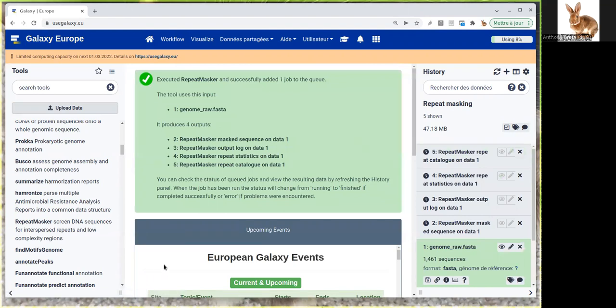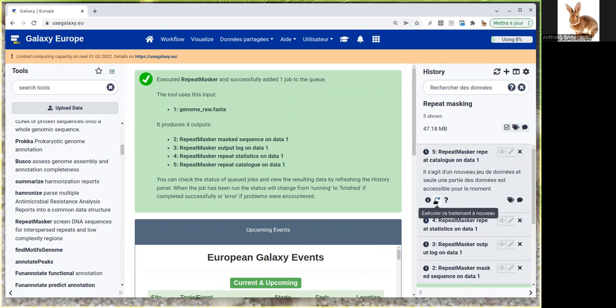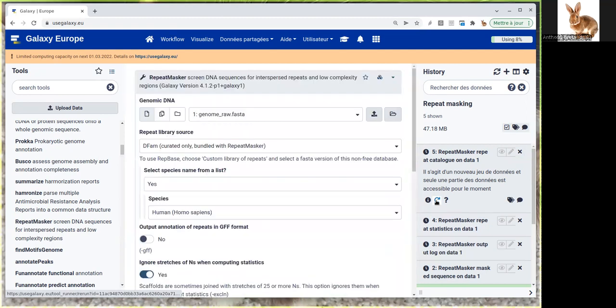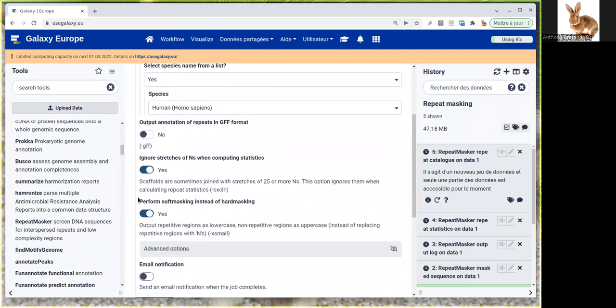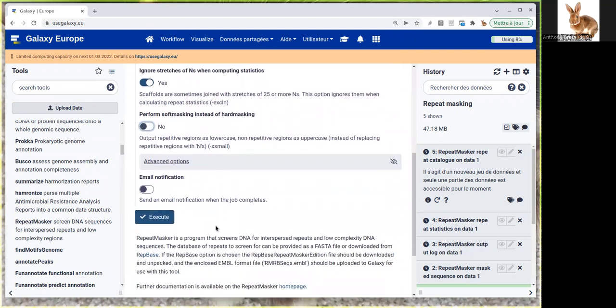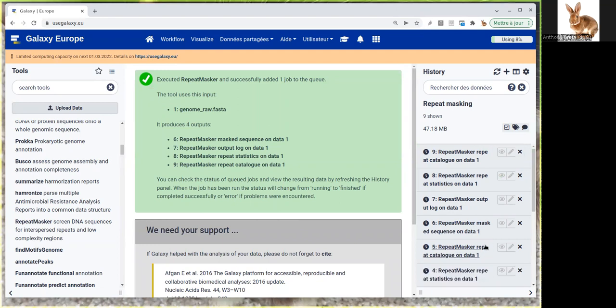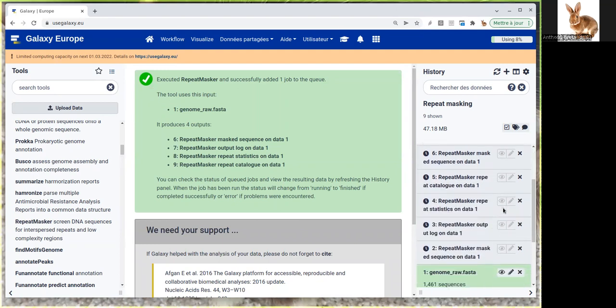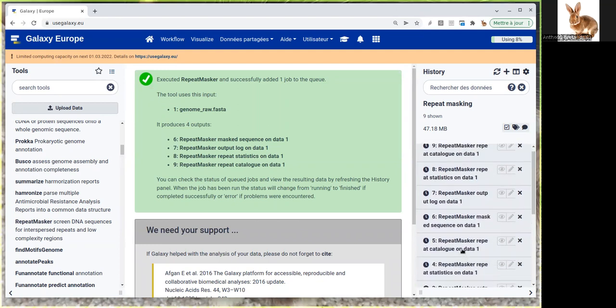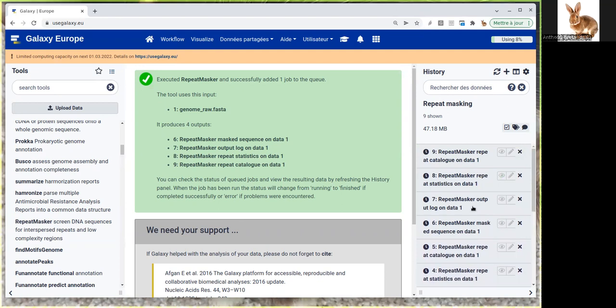Just to show you the difference between soft and hard masking, I'll launch the same tool by clicking this refresh button, which allows re-executing the same job. But instead of doing soft masking, I'll perform hard masking. Now we'll get results for both and compare them when it's finished.